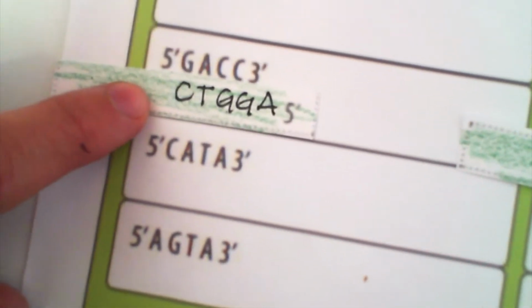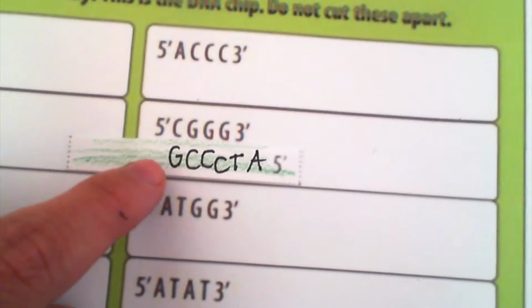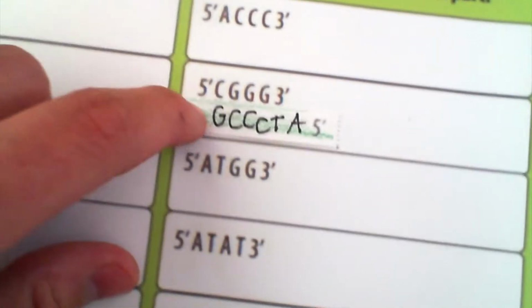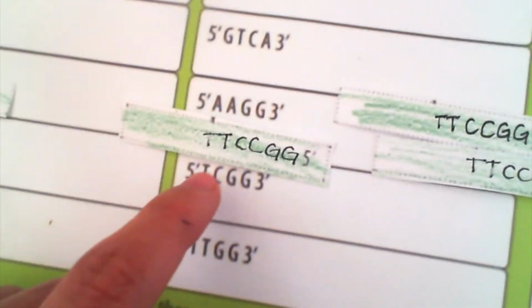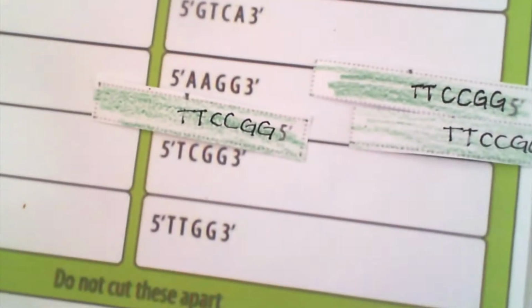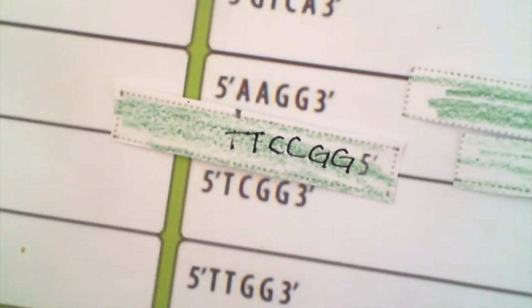Nothing here. This one down here, they all matched up. And then nothing, nothing, nothing. This one was kind of easy to match up because you can see it right there. Nothing, nothing, nothing. And this one was kind of cool because you can have more than one cDNA attached to the actual microarray. So all 3 of these cDNAs were able to stick to this microarray right here.